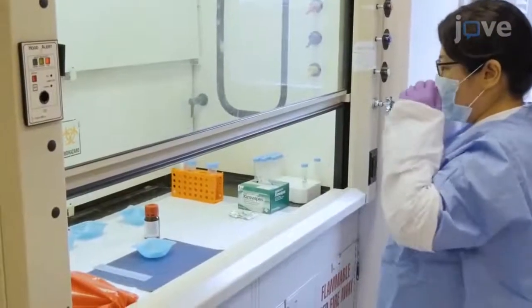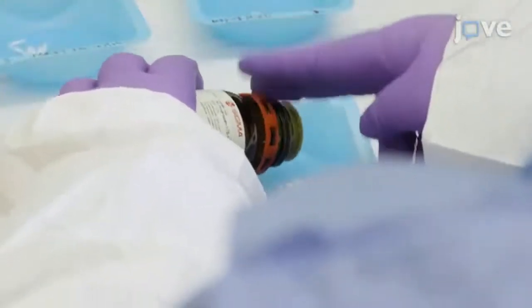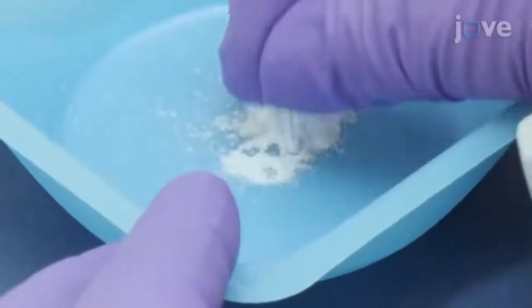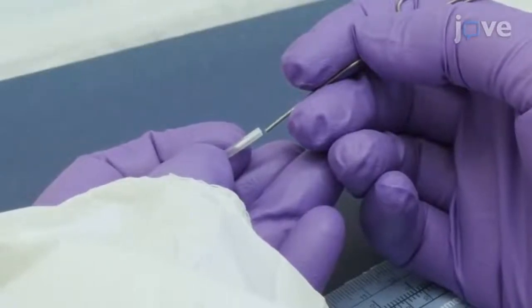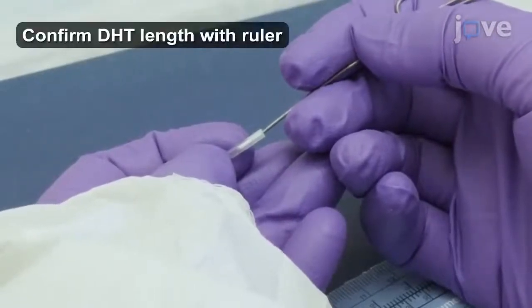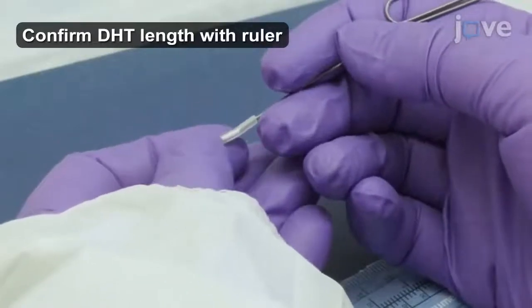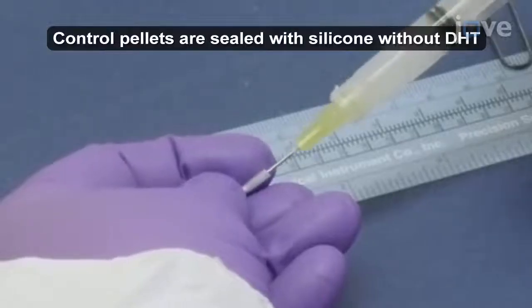Wearing the appropriate personal protective equipment, pour DHT powder into a plastic weigh boat in a flow hood, and press the open end of the adhesive-capped tube into the powder. Using a large, straightened paper clip, tamp the powder down into the tubing until the DHT reaches the appropriate experimental depth. Then seal the open side of the tube with silicone overnight.